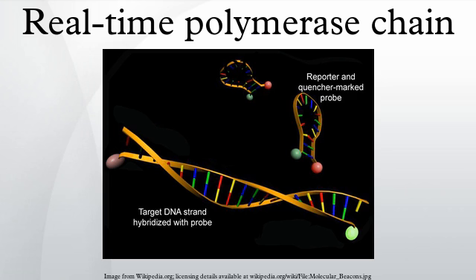Quantification of gene expression. Quantifying gene expression by traditional DNA detection methods is unreliable. Detection of mRNA on a northern blot or PCR products on a gel or southern blot does not allow precise quantification. For example, over the 20 to 40 cycles of a typical PCR, the amount of DNA product reaches a plateau that is not directly correlated with the amount of target DNA in the initial PCR. Quantitative PCR can be used to quantify nucleic acids by two common methods, relative quantification and absolute quantification.